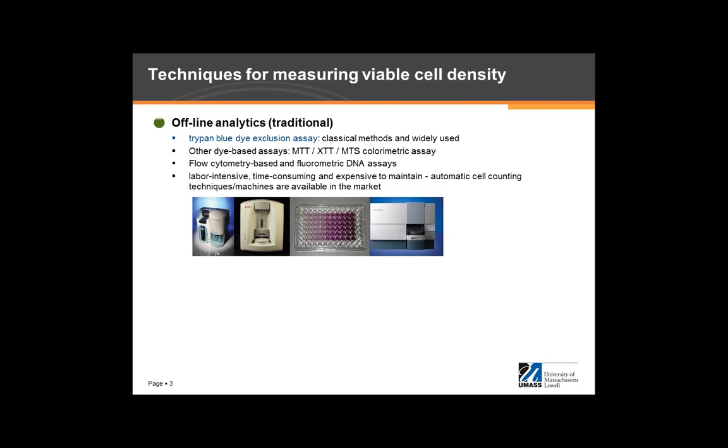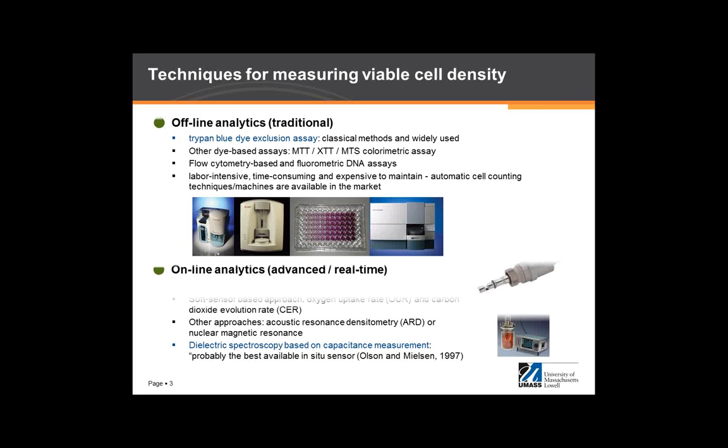And first of all, before we get into dielectric spectroscopy technology for biomass estimation, I want to briefly mention what the technologies available for measuring viable cell density are. In the biopharmaceutical industry, viable cell density and cell viability are usually available on an offline basis. So CEDEX and ViCell, and there are multiple choices that you can use to measure viable cell density and cell mass.